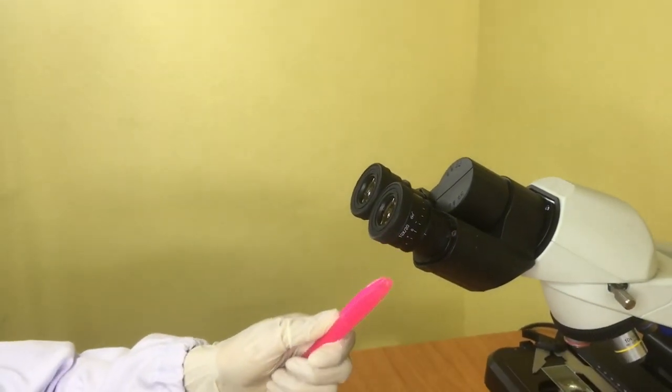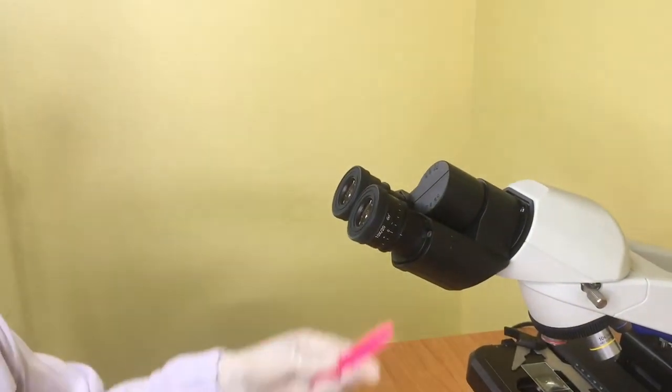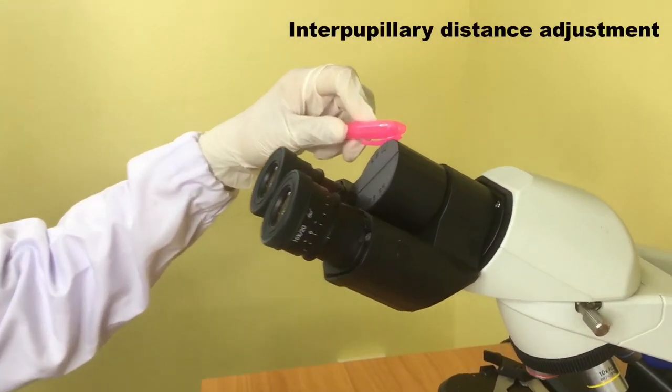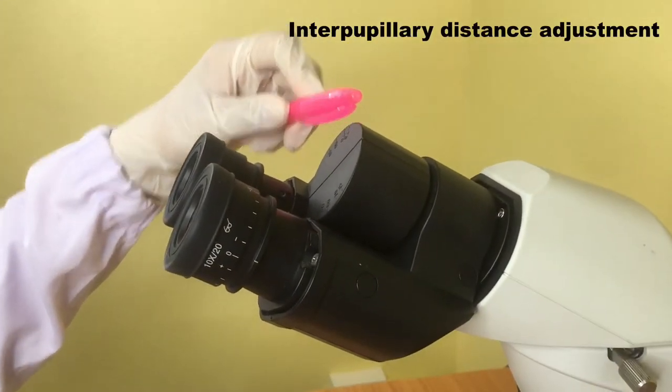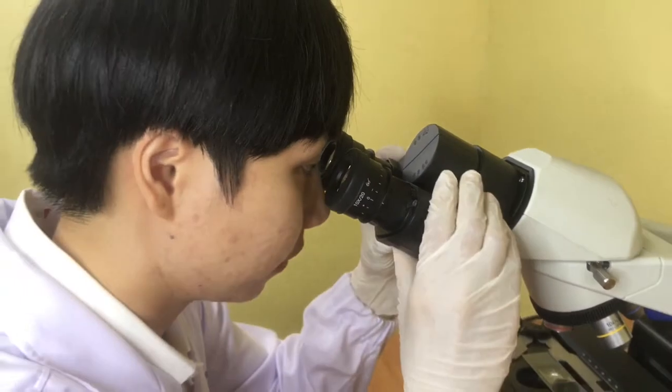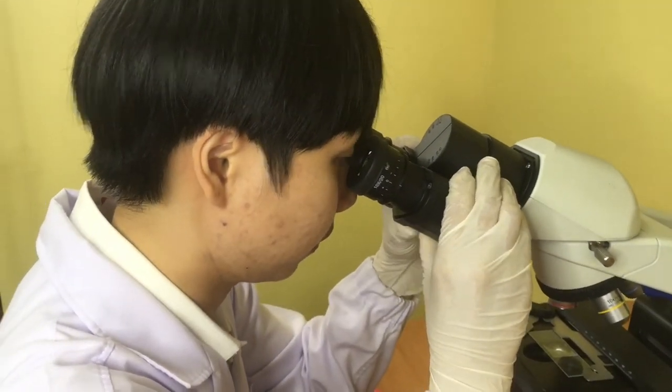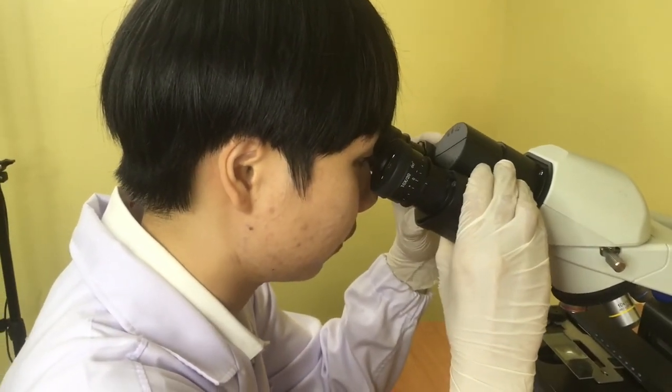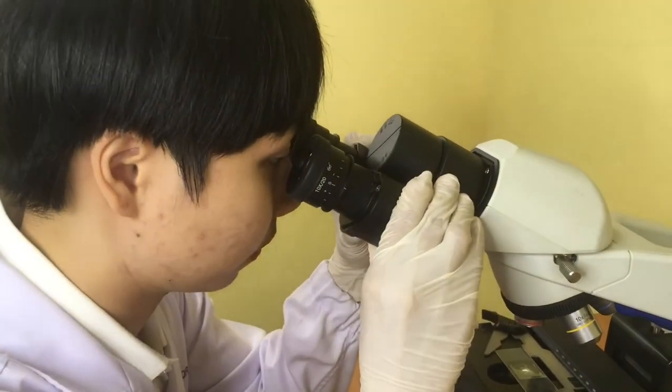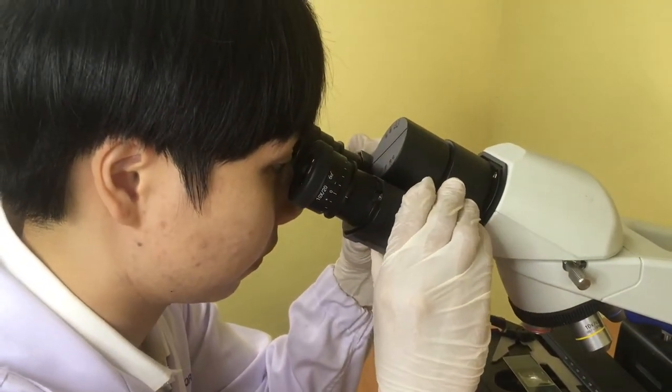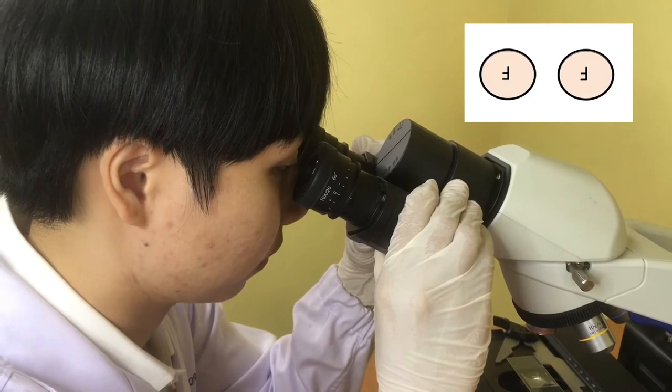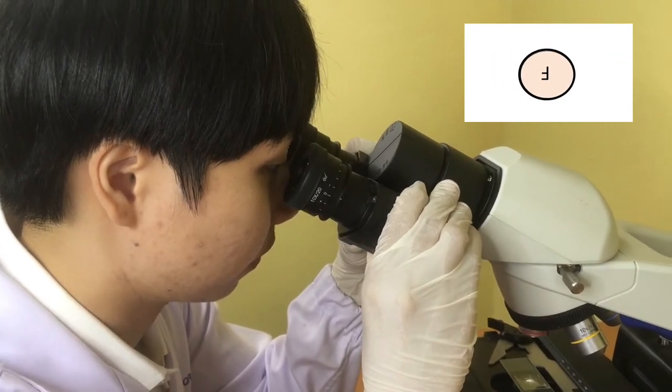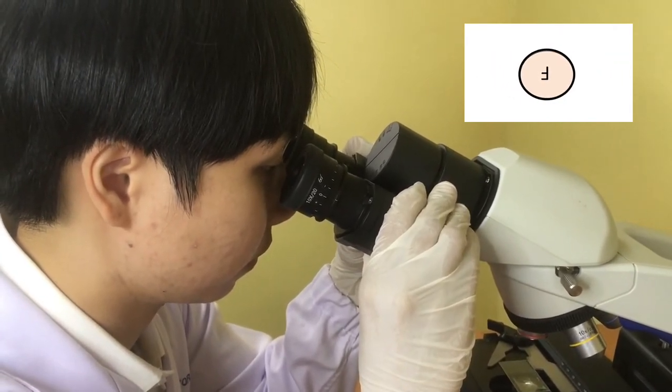Here is interpupillary distance adjustment. If you look through the ocular lens and see two separate images, you should make an adjustment. By adjusting the interpupillary distance, the two separate images should merge into one to allow you to see one sharp image.